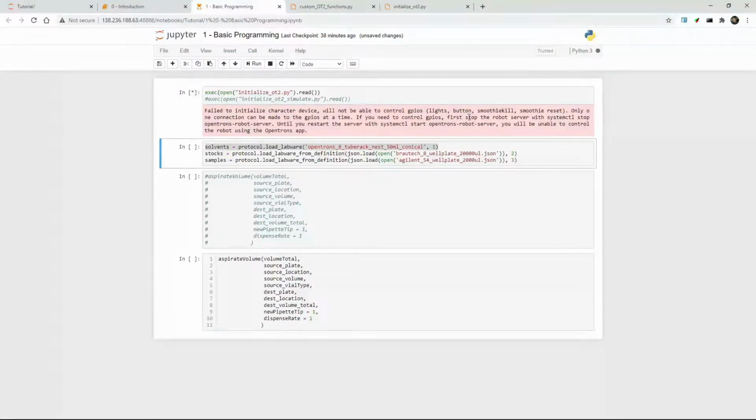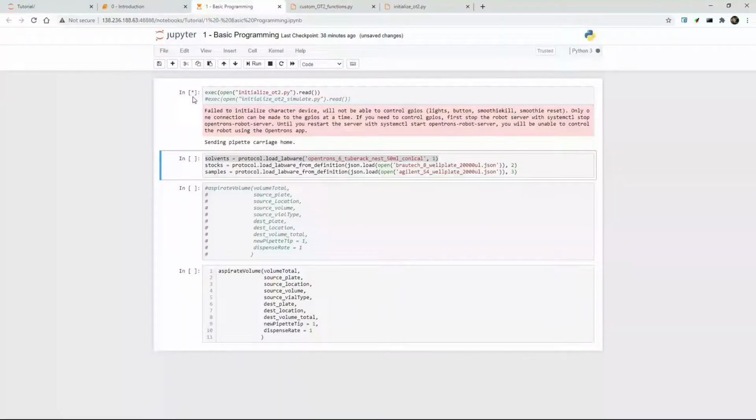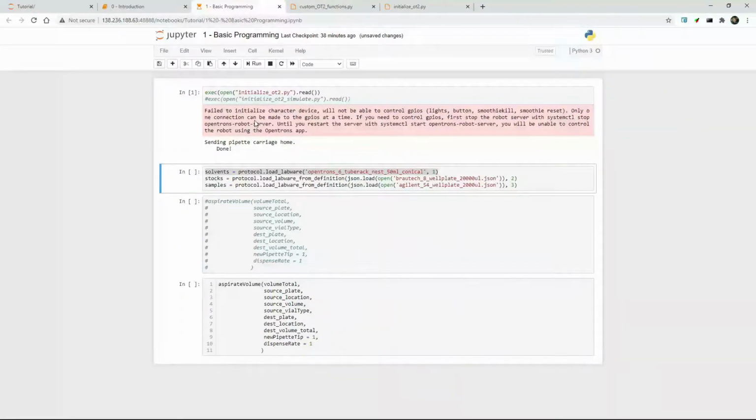This is fine. It happens all the time. And so this little star that we see right here is the robot. There is an indicator that code is actually running. And so in a little bit here, we'll go through what it's doing right now in the future.